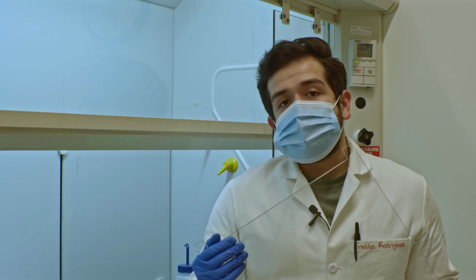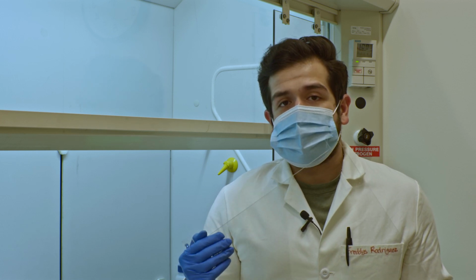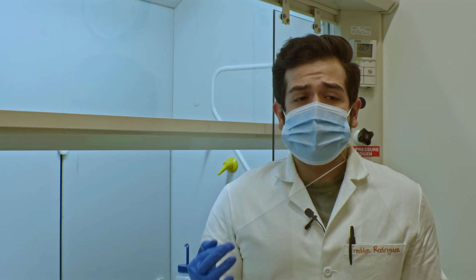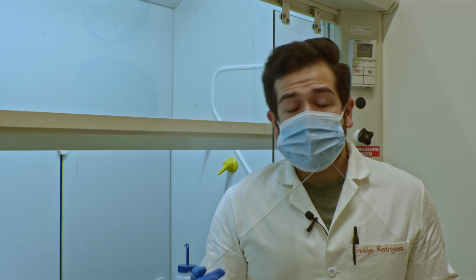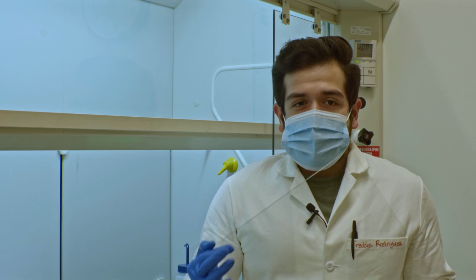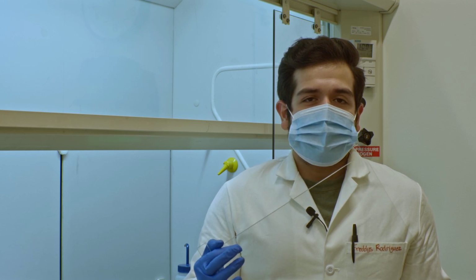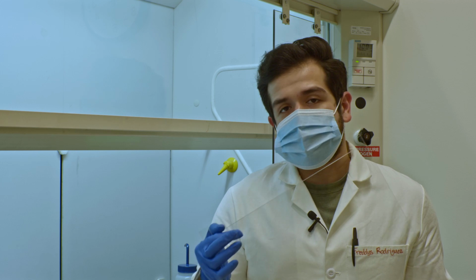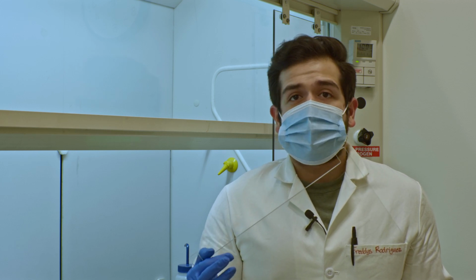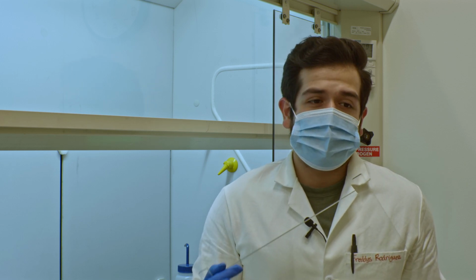The next thing you have to do after you clean the glass plates is siliconize one of the glass plates. This is really important because if you do not siliconize the glass plate, or both of them, you can have tearing of your gel. Whenever you take these gels off of the apparatus, they start to cool down quite quickly. When they cool down, they start to stick to the glass, and whenever you try to pop it open, you might get a tear. And of course, then that's just an unlucky day, and we want to prevent that as much as possible.